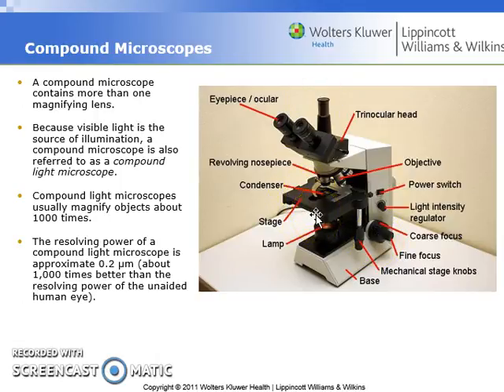Now, even if you looked at bacteria using just a 4x power, you aren't likely to see the bacteria, because bacteria, remember, are measured as 1 micrometer, and for us to be able to view them, we have to magnify the bacteria 1,000 times. So we use a special lens that's called an oil immersion lens, and it has a typical power of about 100 magnification, or 100x.